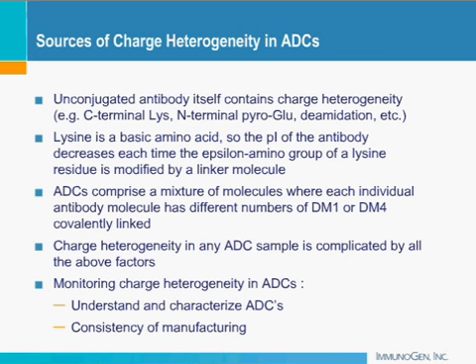Even when the analysis was done on multiple occasions, there was no change in the pI. The day-to-day precision and recoveries also looked great, with less than 20% RSDs. For concentrations greater than 4 micrograms per mL, the recoveries were all well within 80 to 120%. So we used this data to generate a calibration curve of the antibody, and then we analyzed the conjugate sample and tried to quantitate the unconjugated antibody in the conjugate sample. This slide talks about two different approaches that were used to look at the UMAB level in the ADC.